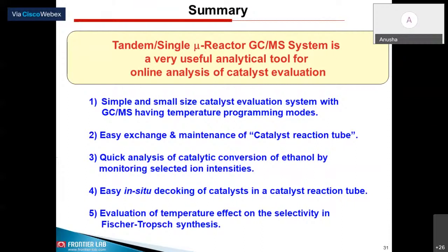And also, the catalyst reaction tube, as I've shown you, is very simple and easy to exchange and maintain. Even though some coke deposition takes place, as I've already mentioned, above 500 degrees you can just decoke and eliminate all the carbon-decomposed particles on the catalyst. And also the quick analysis of catalytic conversion of ethanol by selected ion intensities.